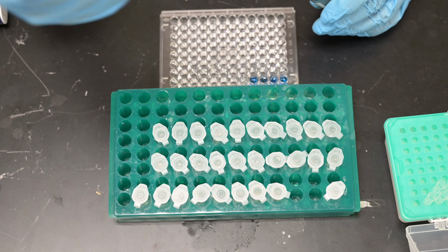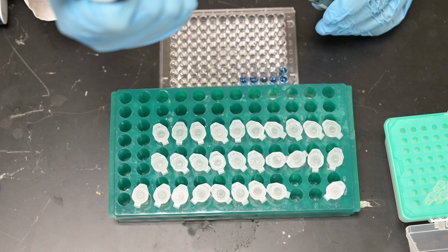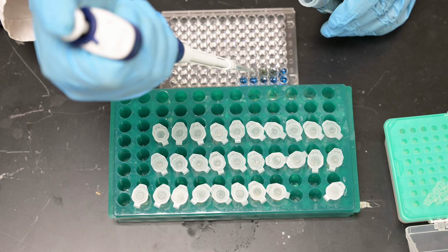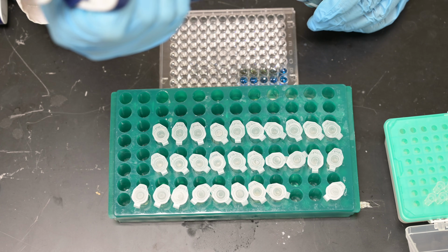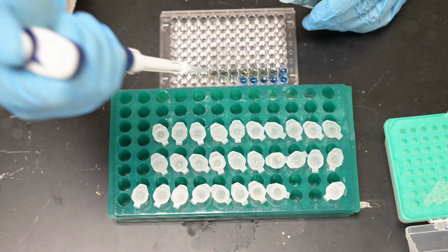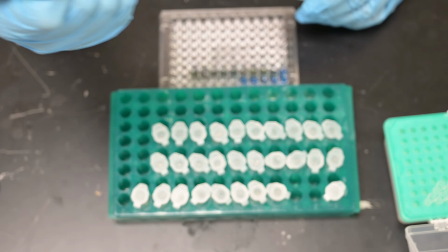So the first row has 5 samples. Second row has 10 samples. That's number 10.